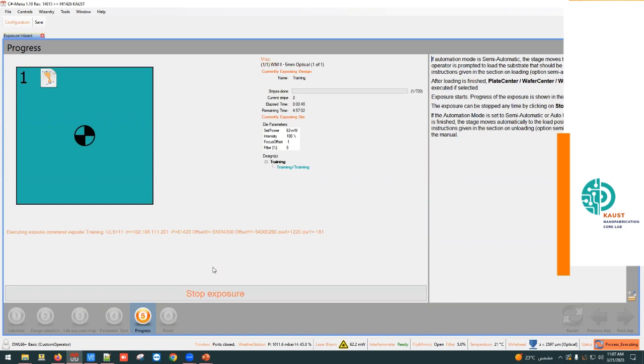Any other question? Hi, Erica. Hi. Can you show us how to do the alignment today? No. This is a first real advanced training, and I wanted to open the tool fast to allow people just to fabricate their own photomask or to fabricate any sample.